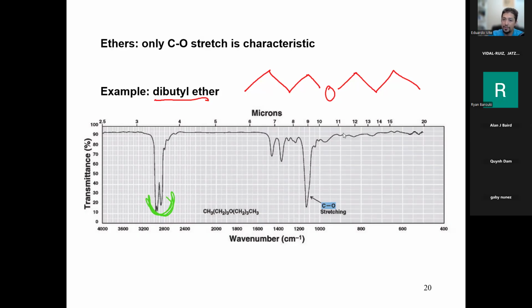And again, be specific. You have the structure, so you can be specific. All of these are tetrahedral carbons. All of these are sp3 carbons. So these are your sp3 CH stretch. You have to know that. What else? Well, we saw these two earlier. These are probably our CH bending. Which ones? I don't know. I just know that there's CHs and their bendings, right? I can only tell from the stretches. The bendings, there's all sorts of bending motions.